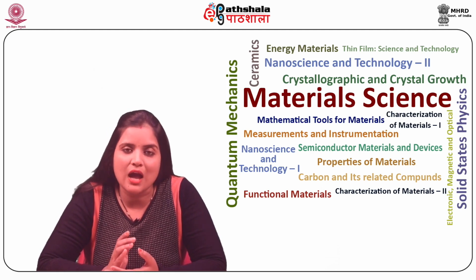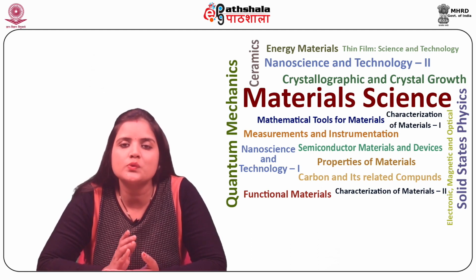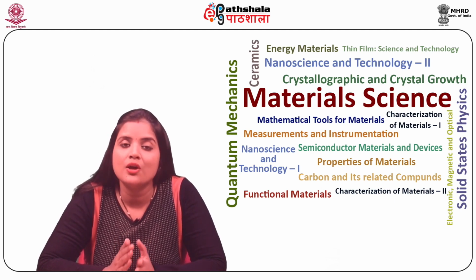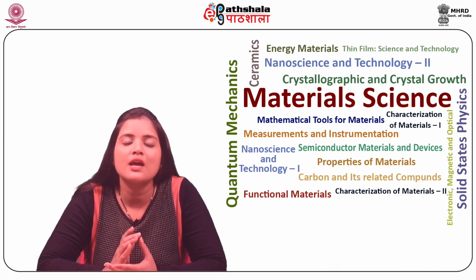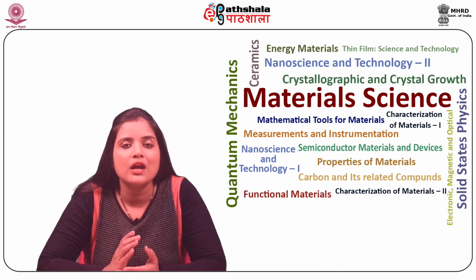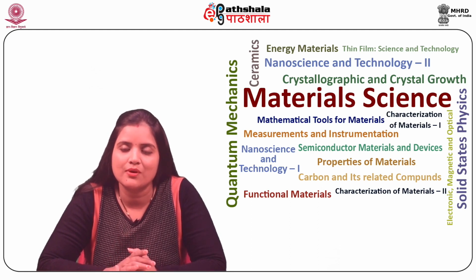Some of these mechanisms are: number 1, constant force feedback. This mode is very similar to the feedback mechanism used in atomic force microscopy, that is AFM. Experiments can be performed in contact, intermittent contact, and non-contact modes.